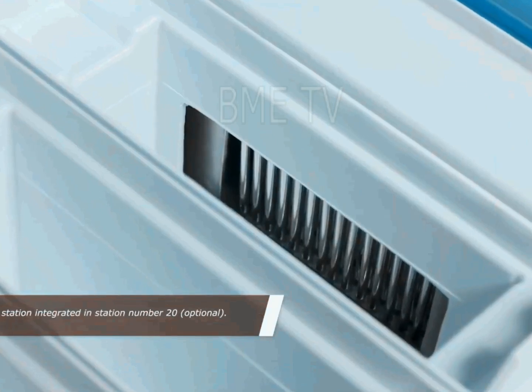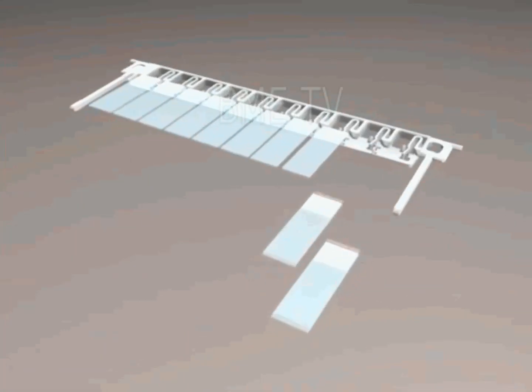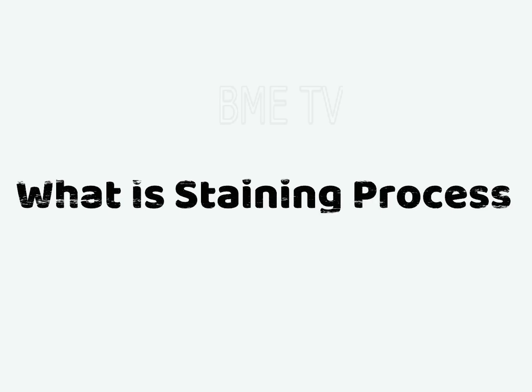As we continue through the analytical equipment series videos, I would like to cover one more piece of equipment which is modern day, widely used in laboratories: the automated slide staining machine. Let's understand what the staining process in a pathology laboratory is.